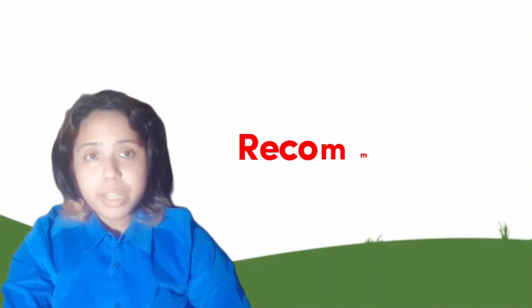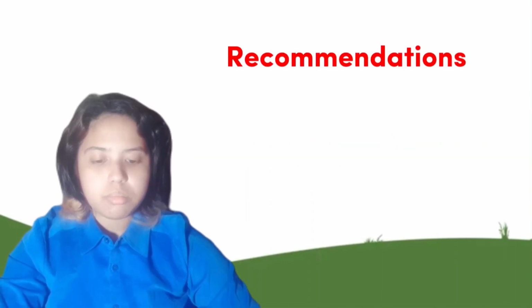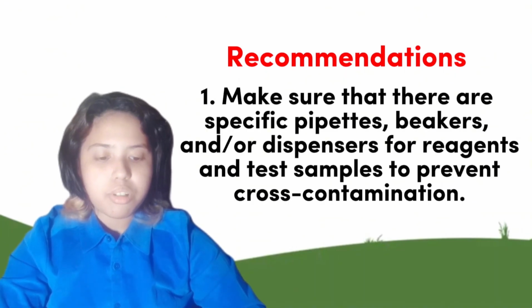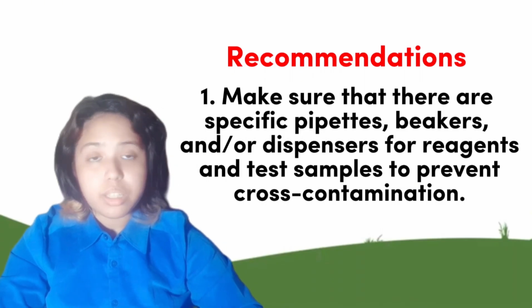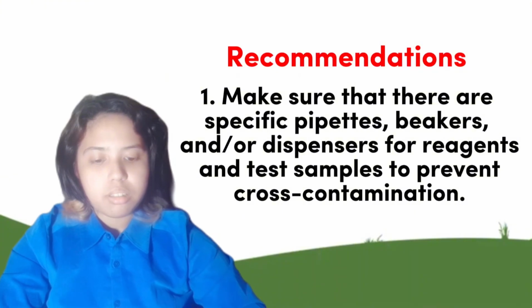And for our recommendations, the group suggests improving the following: making sure that there are specific pipettes, beakers, and/or dispensers for reagents and test samples to prevent cross-contamination. If required, dissolve the lipid in a suitable solvent such as ether or chloroform before testing.